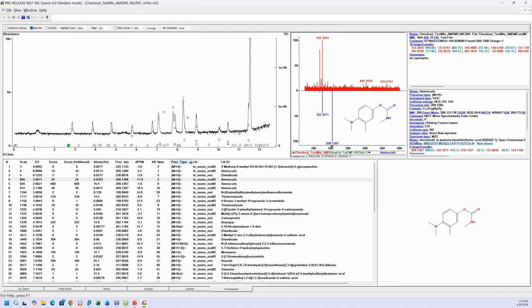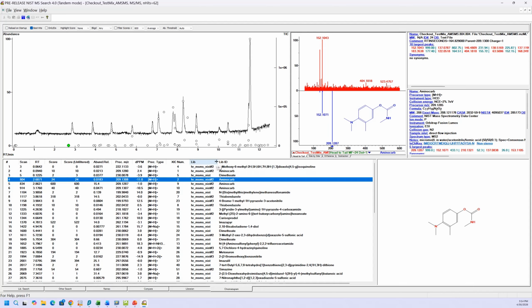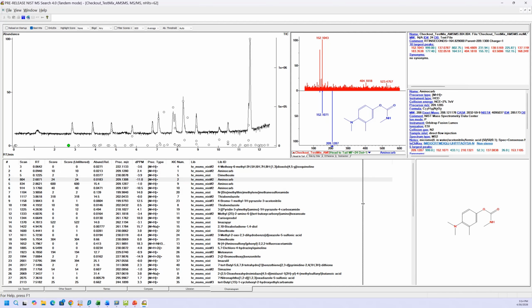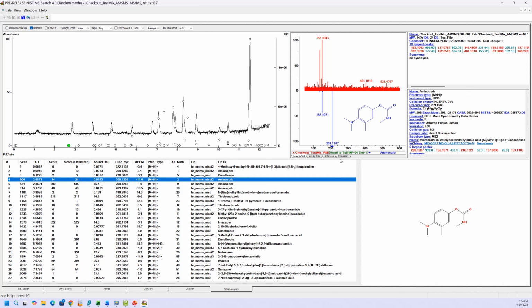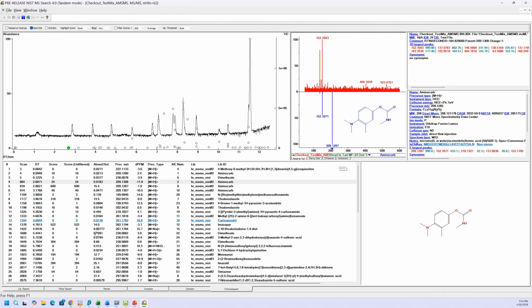So if you want to stretch a window, you can grab the corner here and take your left mouse button and move it around. If you want to move it over to the next one to get it closer to the other place, you can do that. You can stretch things if you want to, or you can condense them to save space. All the windows are movable. You just go to it, you see a little bitty double arrows, and then with your left mouse, when that shows up, just pull it to where you want to. So you can really configure it any way that you want to.